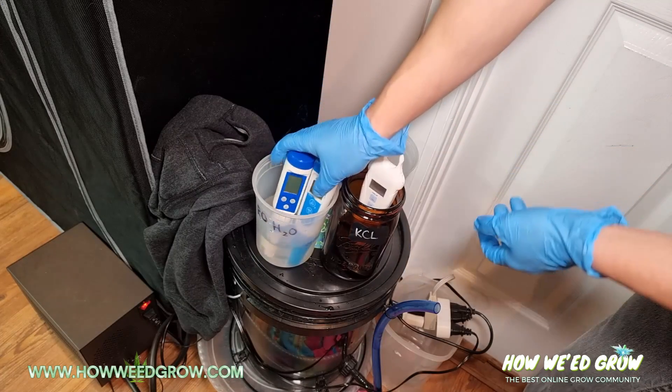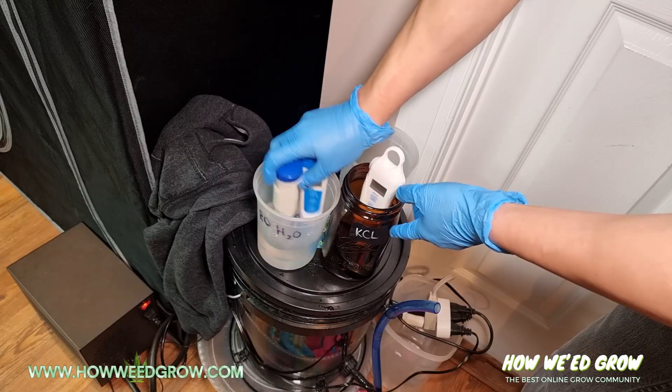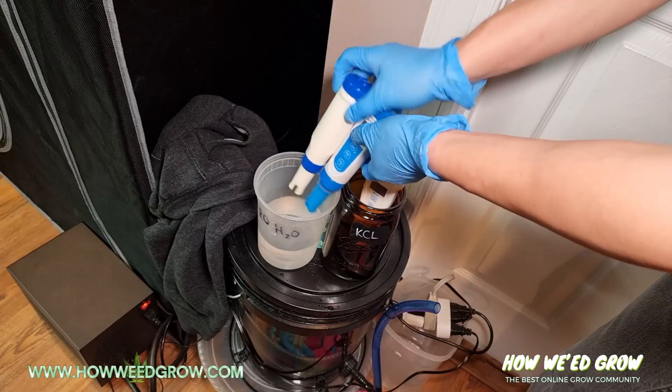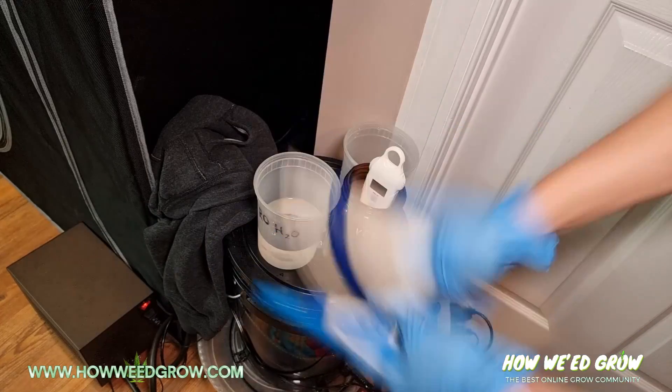That's just going to clean off the probes. Swirl it around. Once it's swirled around, shake it to let off all that excess water.